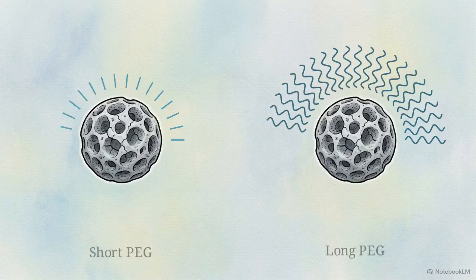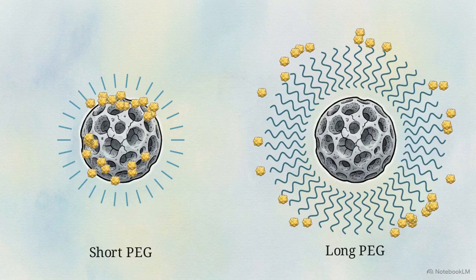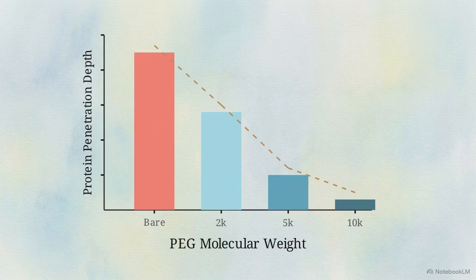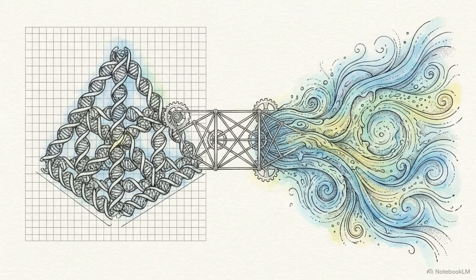Using D-Storm, researchers can track this intrusion in mesoporous silica nanoparticles modified with varying lengths of PEG chains. This comparative data illustrates how modifying the PEG molecular weight alters the depth of protein intrusion. As the molecular weight of the PEG coating increases, the penetration depth of the protein corona drastically decreases. This quantitative data allows nanomedicine engineers to design better cloaking and shielding for targeted drug delivery systems. Super-resolution mapping acts as the ultimate bridge between synthetic material design and biological reality by quantifying the dynamic biointerface.